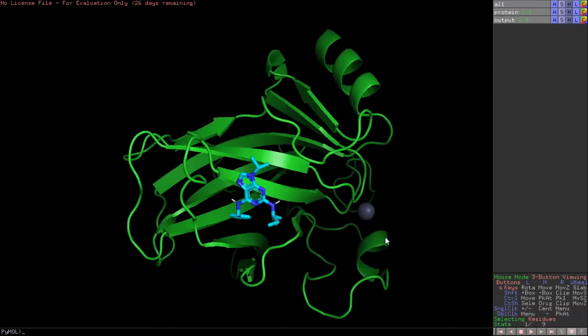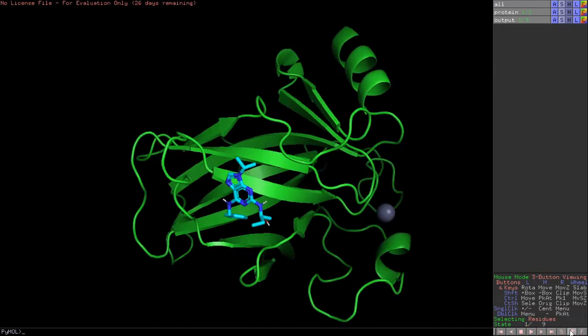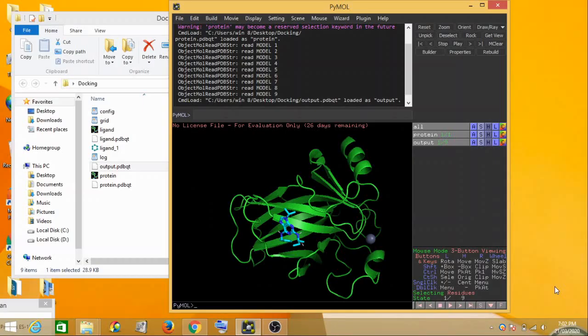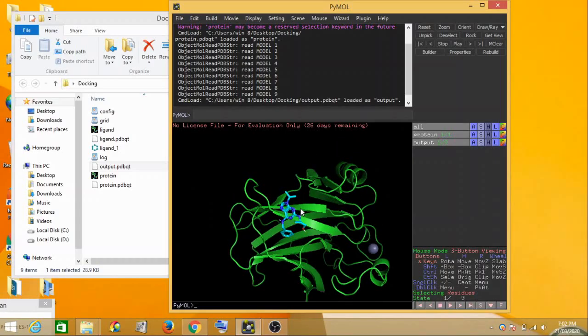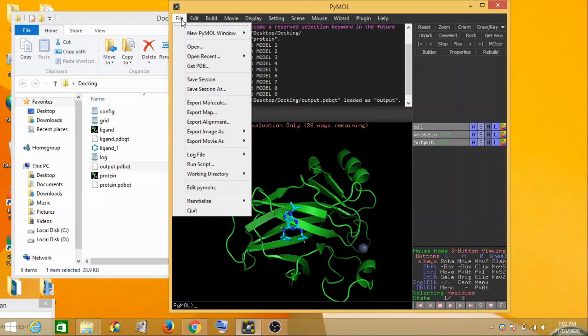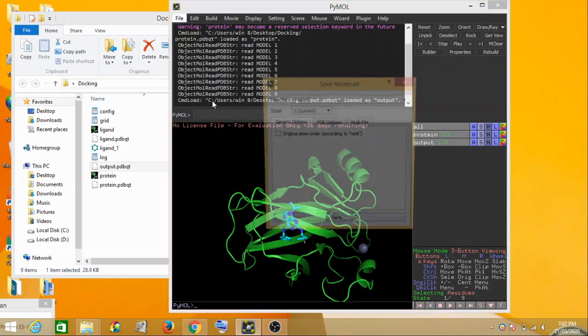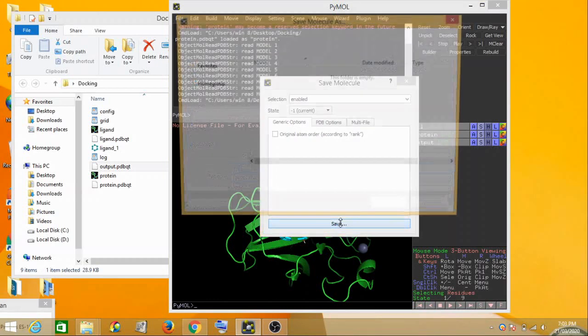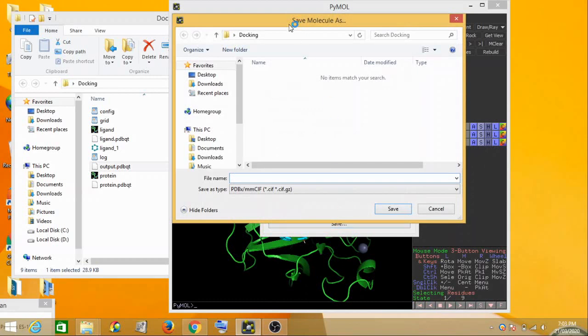In order to do that, this is your pose and this is the protein. We'll have to save this entire best protein complex. So we'll go to file and then we'll say export molecule. Then selections, we'll just leave it as enabled. Then we'll click on save.